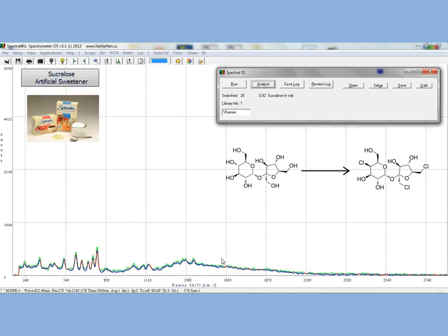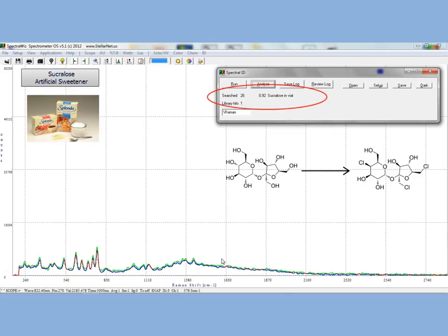Once you collect your Raman Spectrum, you can click the Analyze button in the Spectral ID tool panel and see the nearest match, which here is sucralose in a vial exactly correct.